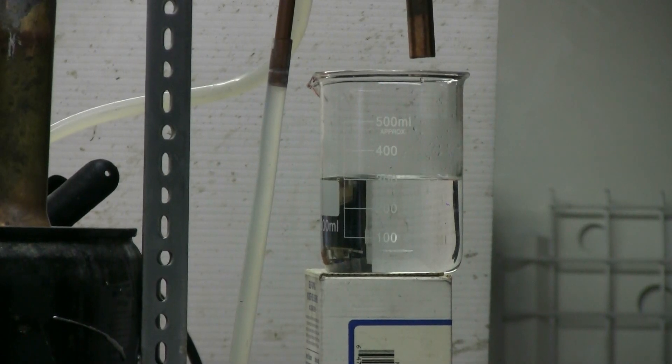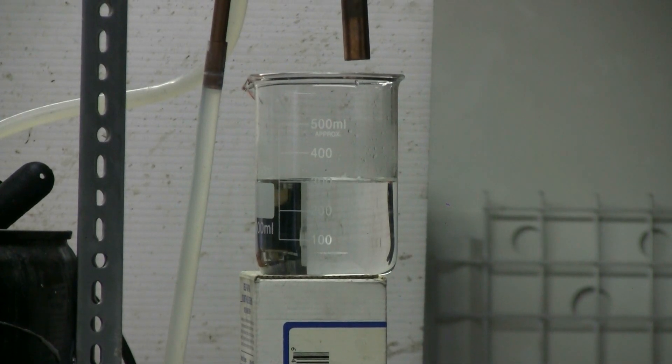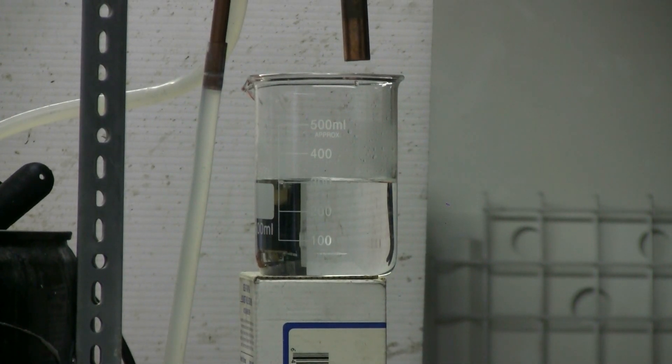Ethanol is being steadily recovered — we can see it dripping out the end of the condenser pipe and collecting in a 500 milliliter beaker. From this particular batch, I've already extracted 850 milliliters into another container and now I've got more than 300 milliliters more. I periodically catch a drop on a glass rod and light it with a lighter to make sure that it is in fact largely ethanol and I haven't switched over to just getting water.